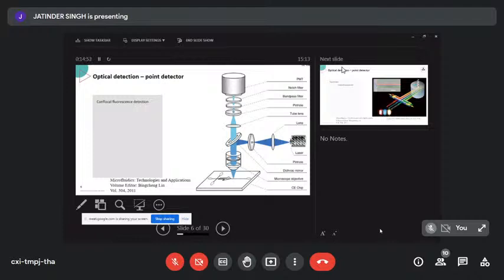And I've tried to get a couple of them commercially available, but from my experience, if you want to do fluorescence detection in microfluidics, it is get friends with the Edmund Optics or whatever the optics companies are, get friendly with the catalog, get a paper in there, realize the parts that you've got to do, be prepared to spend 2 days in the lab aligning all of these things because they all need to be perfectly straight, and then you never touch it ever again. Once it's focused, don't even think about going home. You get a signal, life is good.